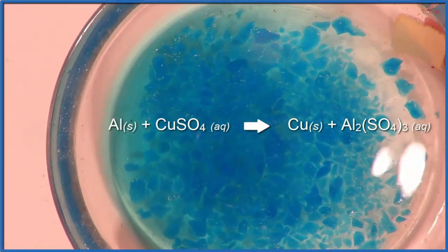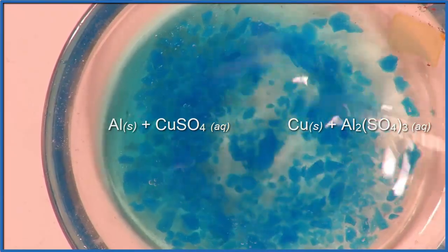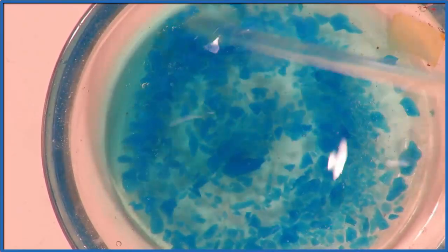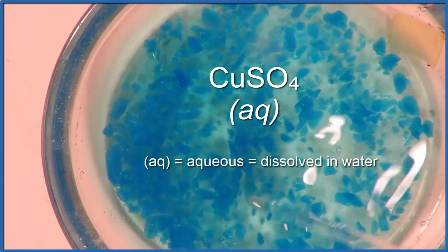This is one of my favorite chemical reactions. It's pretty easy to set up and it happens really quickly. So we have copper sulfate, CuSO4, and I'm dissolving that right now just in distilled water in a small watch glass.